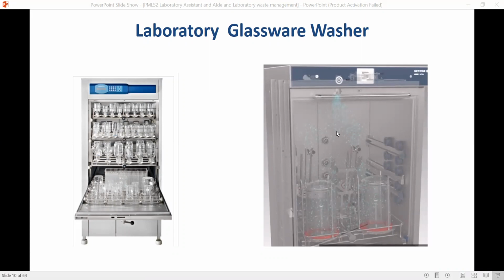Kinuha ko yan from a video. May tubig na lumalabas. May video nito kung paano siya, yung principle, how to wash yung glassware. Kaya malabo kasi kinapture ko lang yung video.